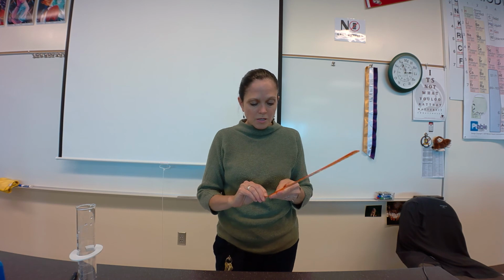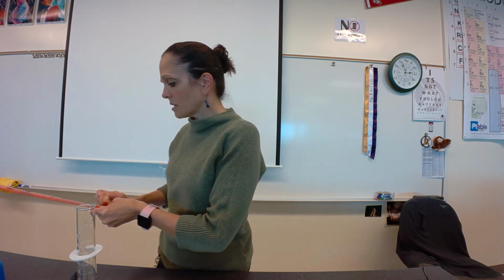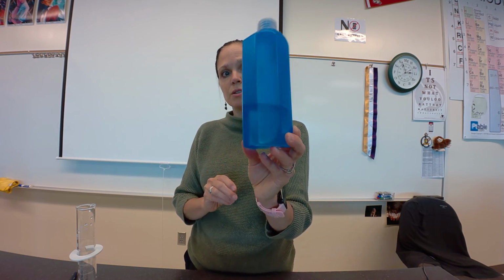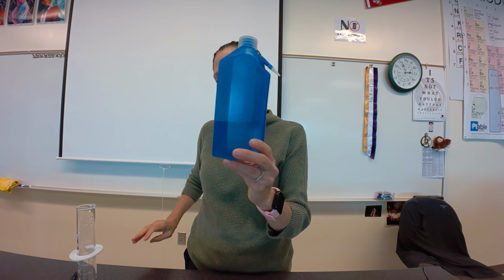All right? So the first thing we are going to look at is the density of some distilled water. Now, I have some distilled water in these blue squeeze bottles, and we are going to make sure that we use the distilled water here, okay?